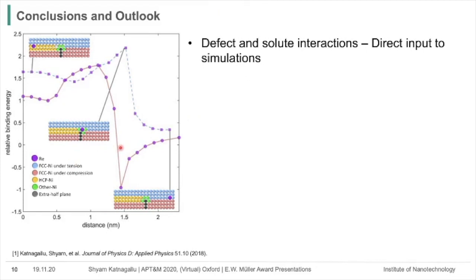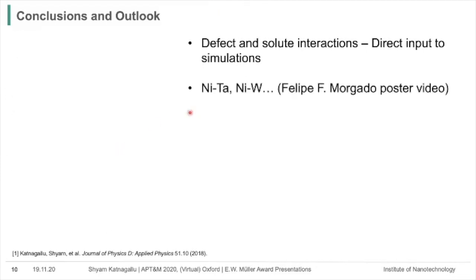Now in terms of vacancies, we are further evaluating this with respect to nickel tantalum and nickel tungsten binary alloys, wherein we are trying to get more statistics on vacancy and solute interactions.